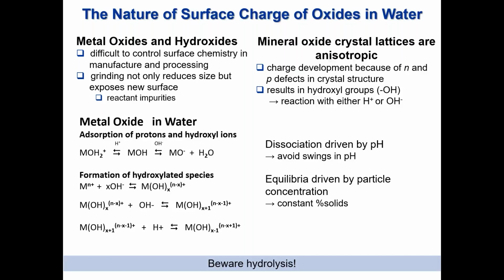Industrial materials are never 100% pure. They contain impurities which can and do alter the surface charge. And the impurity can be electrolytic debris left over from the manufacturing process. Simple test here: take a sample, shake it up in distilled deionized water, let it settle, measure the conductance. You'll see that there's a huge amount of debris left over for industrial materials.